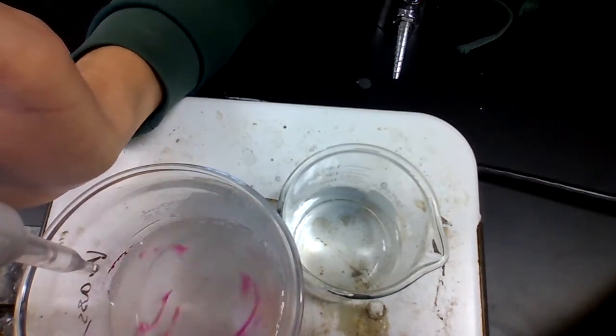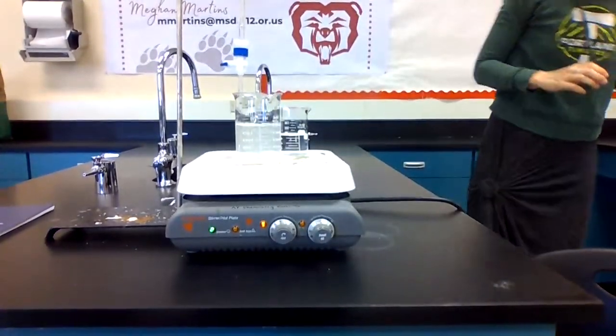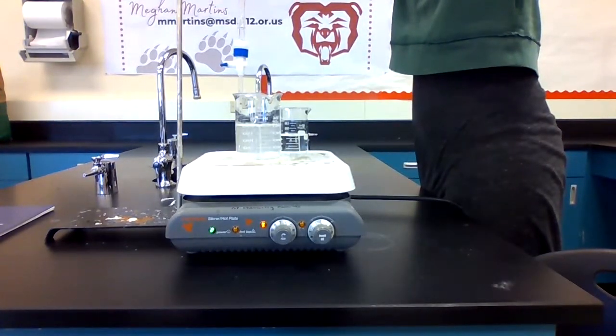Okay. And I just ran out of base in my burette, so I need to reload that. I'm going to add exactly 50 milliliters so that I don't have to figure out another starting amount. I can keep with that 2.5.